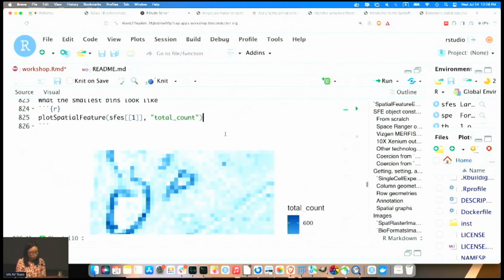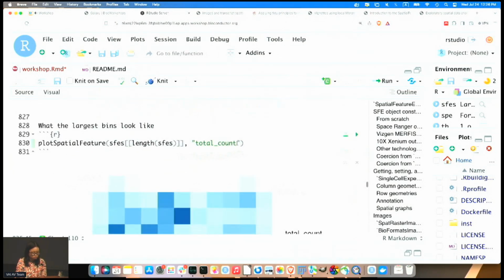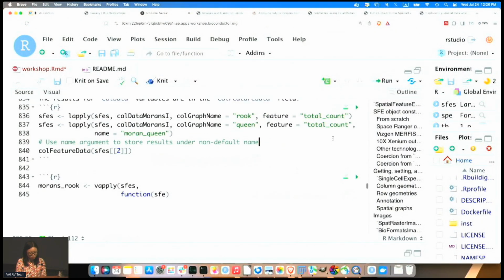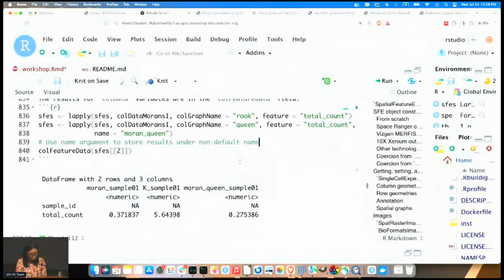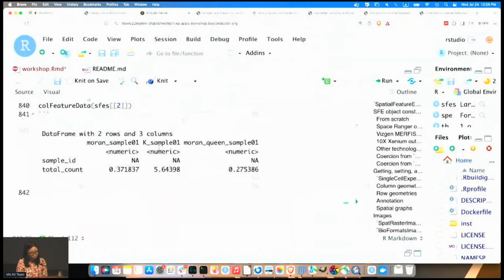I have the bins here. That's what the smallest one looks like, and that's what the largest one looks like. Here I compute Moran's I for just total count. For col data, we can use the colFeatureData getter to get the spatial analysis results.